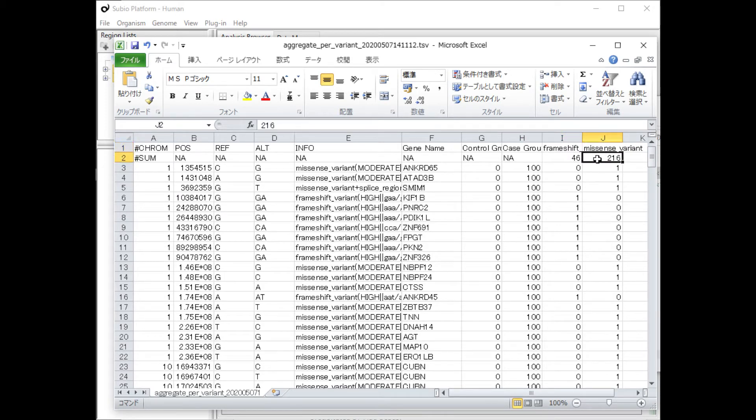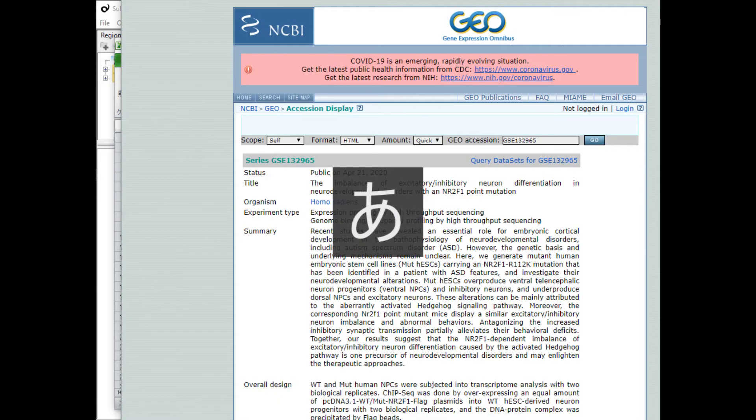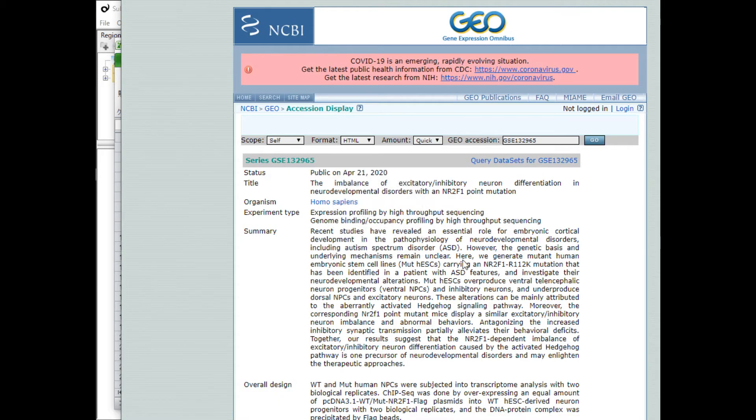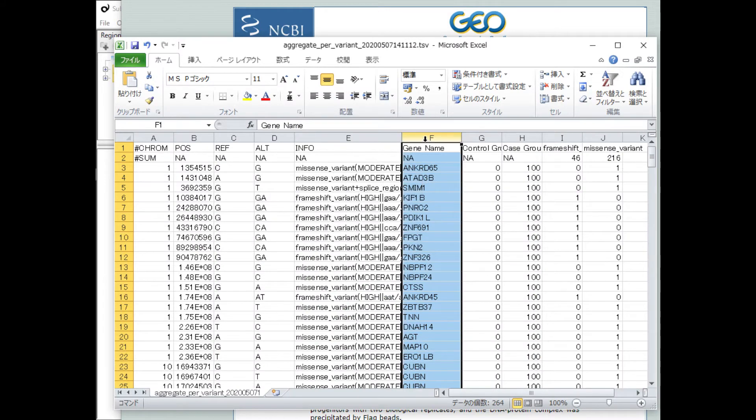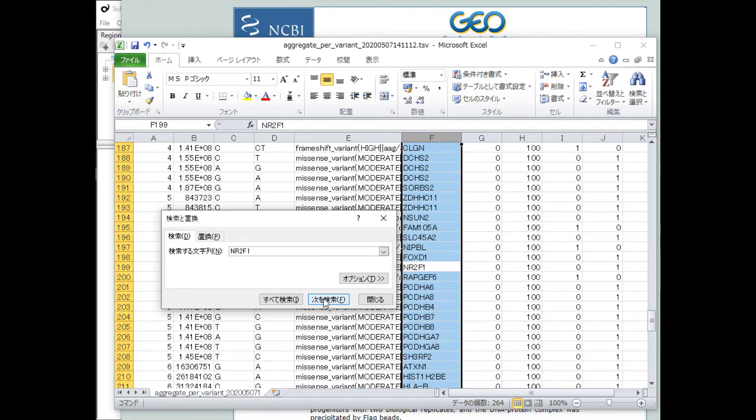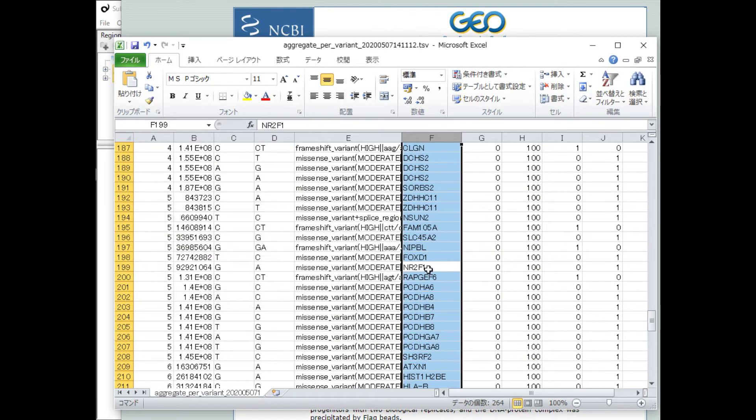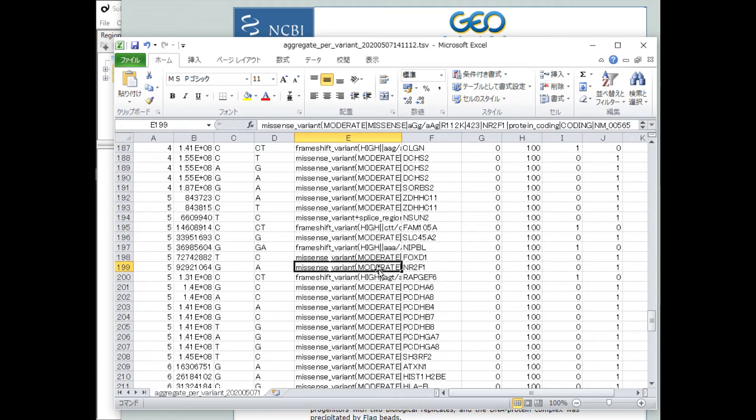I'll try to find out if the gene that originally carried the mutation is listed correctly. As expected, the NR2F1 gene was found. Also, there are more than 200 unexpected genes with missense and frameshift variations.